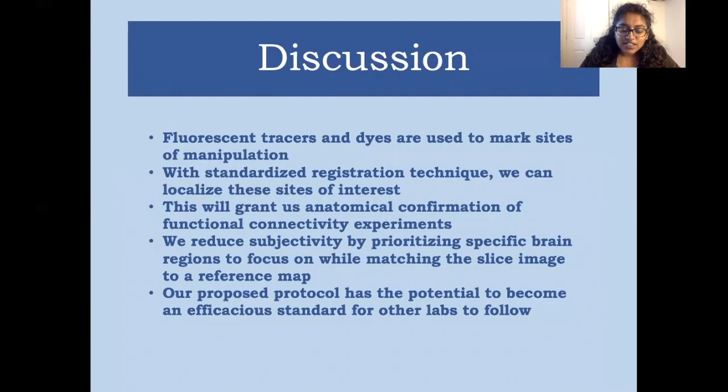In the context of electrophysiological experiments investigating functional connectivity, fluorescent tracers and dyes are often used to mark sites of manipulation. With our proposed standardized registration technique, we are now able to localize these sites of interest, and this helps grant us anatomical confirmation of functional connectivity experiments.